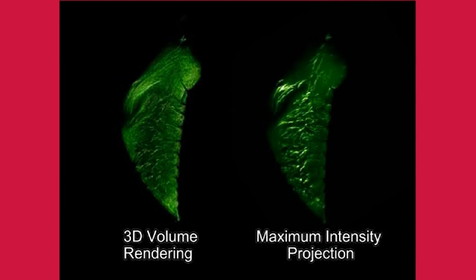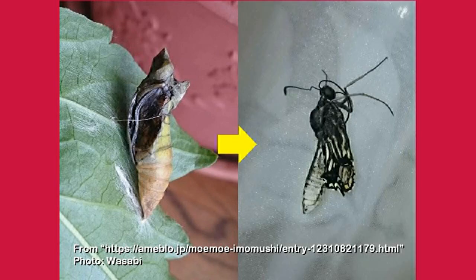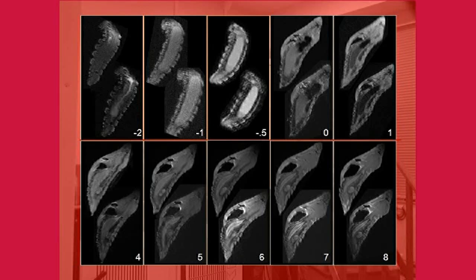However, one of Inu's acquaintances, Horikawa Kori, published a photo of a pupa of Papilio xuthus with a left wing that had failed to deploy, showing that the pupa's wing was actually hollow. The next major change is the appearance of a distinct circular structure on the dorsal side of the pupa's abdomen. This structure was judged to be the testis, which is a male reproductive organ, based on the fact that it cannot be seen in the pupae of female butterflies, which will be introduced next, and the internal structure.